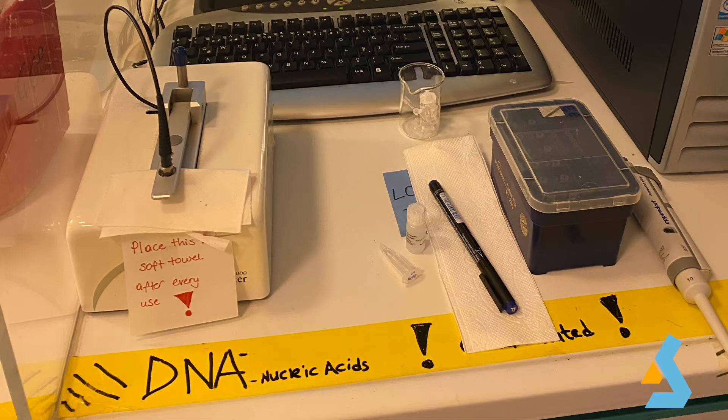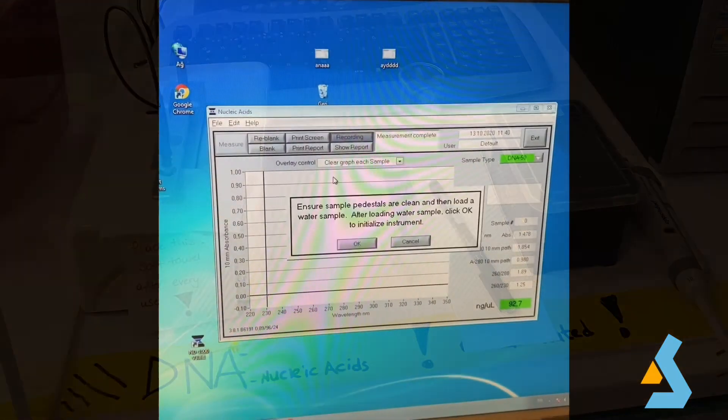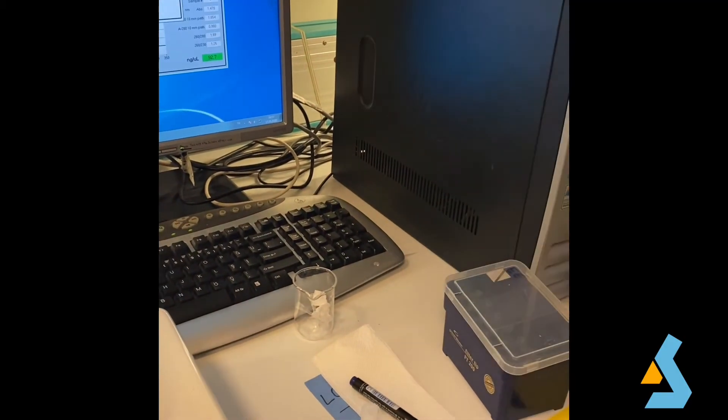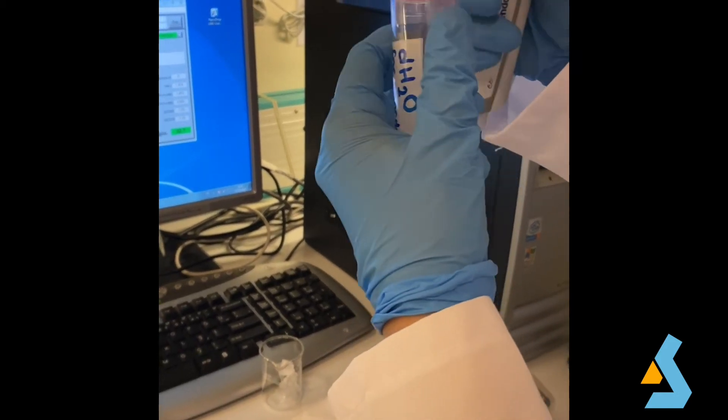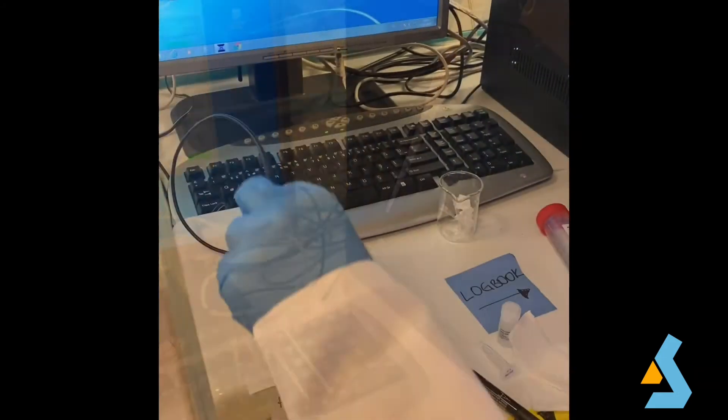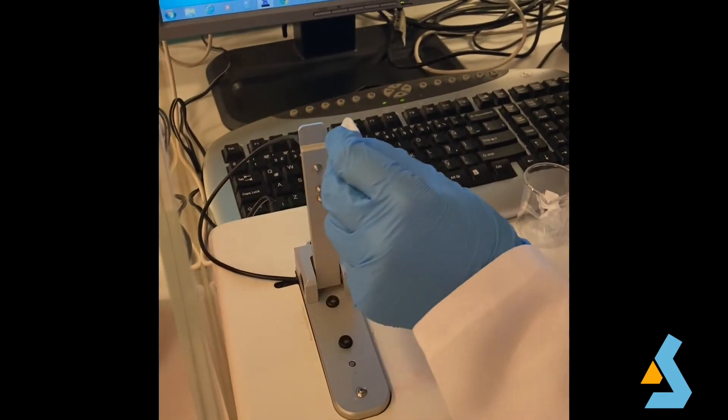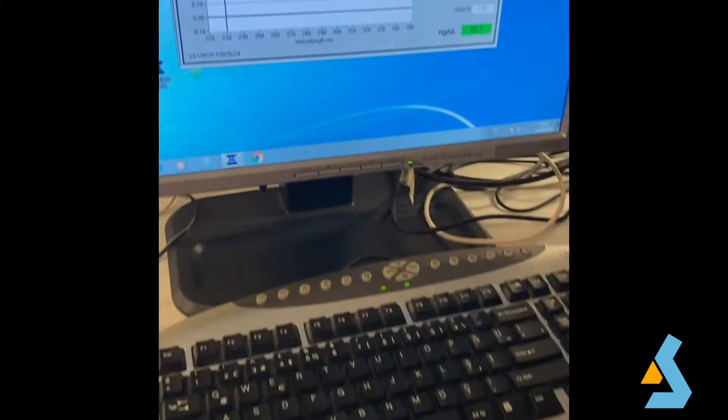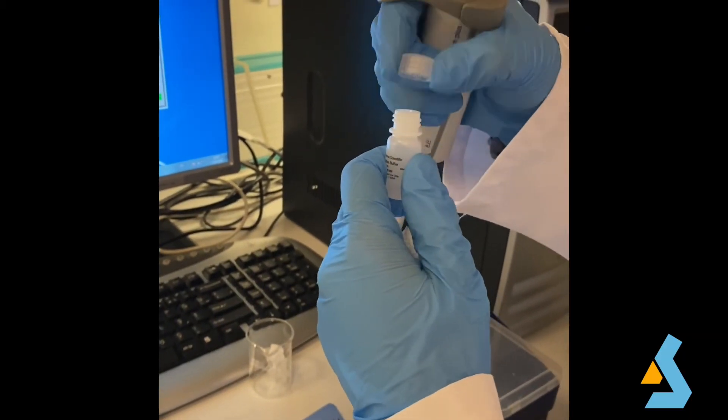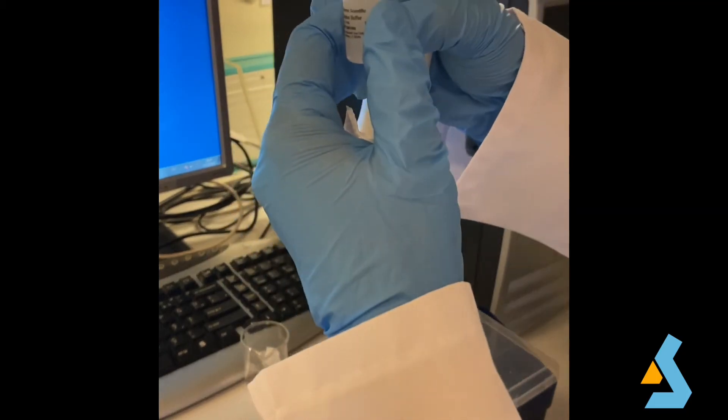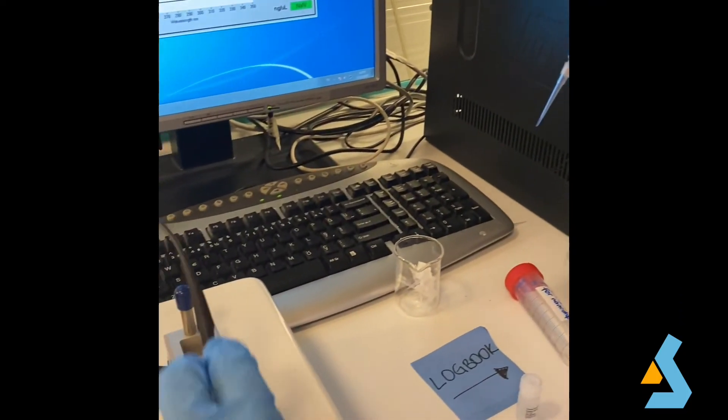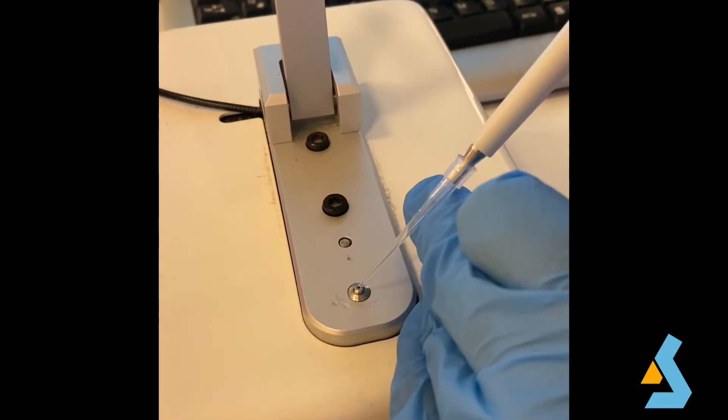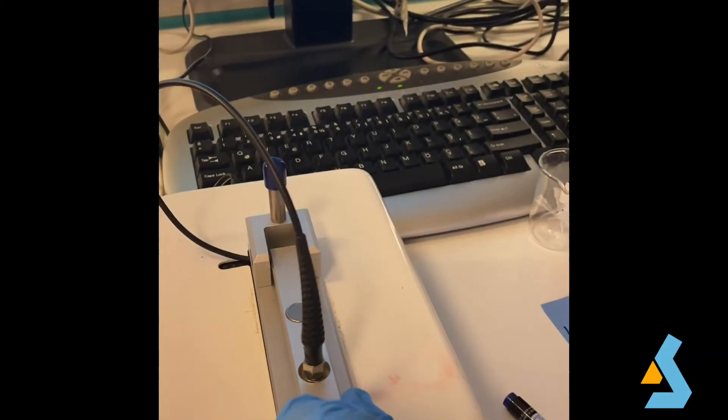Optical density readings taken by a nanodrop can be used to determine the concentration and also the purity of a DNA sample. In the software, we should first select nucleic acids as we are measuring DNA concentration. Before we begin, we need to clean the pedestals. To do that, we should put 1 microliter of distilled water onto the tiny spot on the lower pedestal. In this case, we have to make sure the pipetting is correct. Before adding water, we should delicately wipe off the pedestals with a tissue. Then, we click OK to initialize the software. After cleaning and initializing the system, we should measure 1 microliter of blank. The blank should be the same solution as we use for the elution of DNA. After adding the blank onto the pedestal, we can click the blank in the software. This will cancel out the effects of the elution buffer components and help to truly reflect actual DNA concentration.